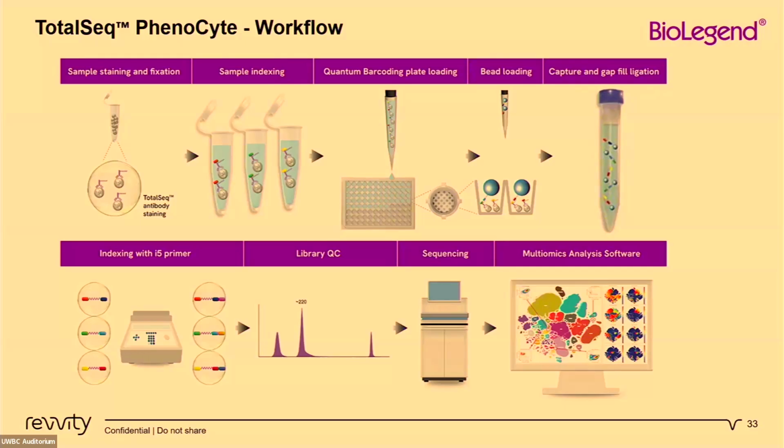Like I said, this plate has these little microwells in it, and it uses gel beads that won't fit into the microwells until you spin the plate down in a centrifuge. So the cells have all settled to the bottom of the wells, but the beads sit on top, kind of like an ice cream cone. Then you put it in the centrifuge, and the bead squishes down into the bottom. Then the bead barcode will be applied to the cells that already have an I7 index.